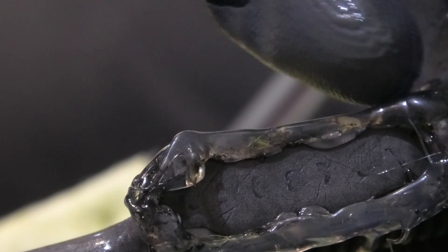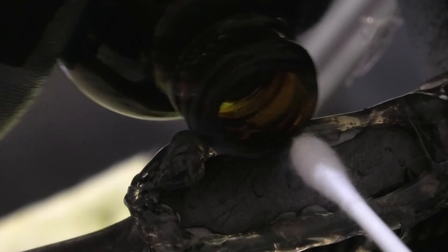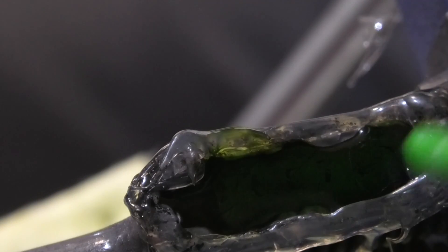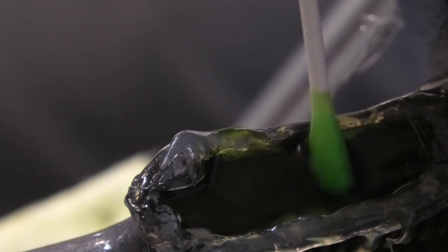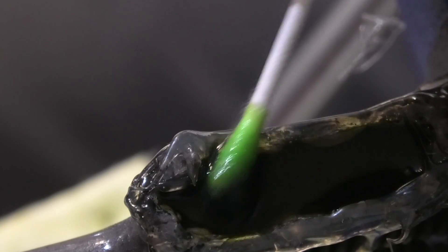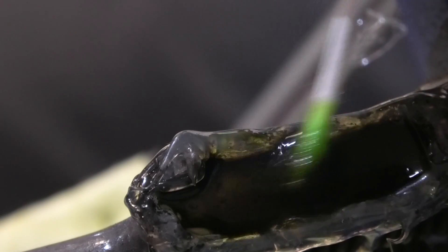Now we're really starting to see some pretty good definition. What this is doing is bringing out those changes in density between the metal that got hit with the die — the little metal stamps that gave this serial number. When that die gets hit into the metal, it pushes that metal into all the surrounding areas, and what we're left with is a little crater, a little dent. Those are left in forms that we can read as letters and numbers.